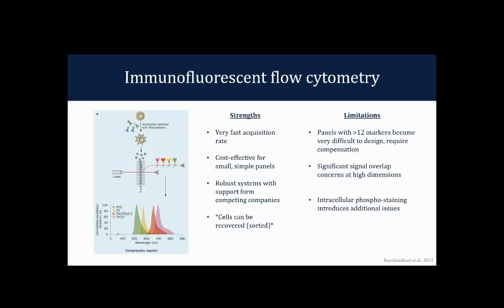Everybody in this context should be fairly familiar with immunofluorescence in terms of flow cytometry, but I'll quickly go over the strengths and limitations that are relevant to the technology, especially in regards to deciding whether or not mass cytometry is something that should be considered.